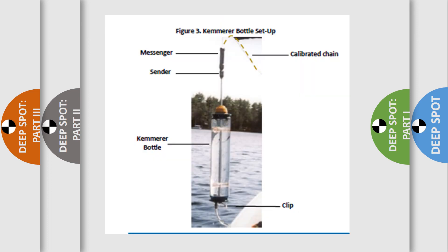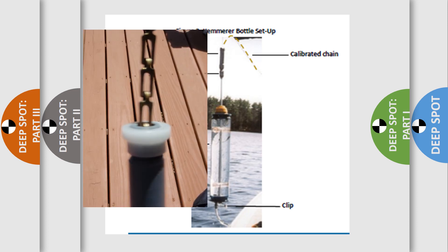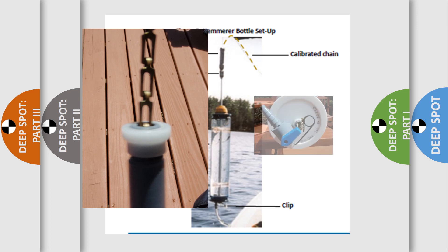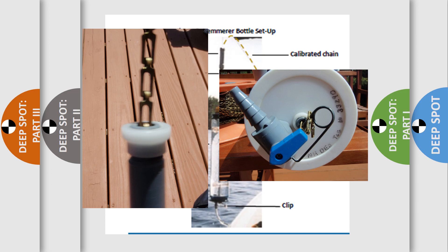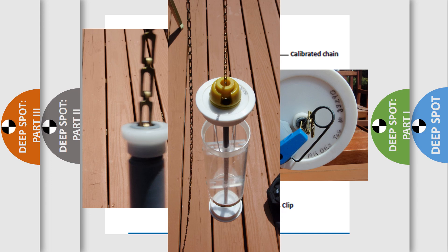Next, you will use a Kemmerer bottle to collect the samples. To set up the Kemmerer bottle, thread the calibrated chain or rope through the rod in the middle of the bottle. Clip the chain securely on the end so we don't lose the bottle. Then check to make sure the clip is secure by holding the bottle from the chain.